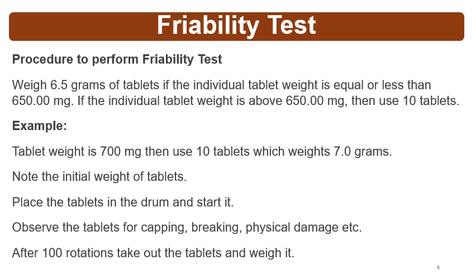The tablet weight is 700 mg, so use 10 tablets. Place the tablets in the drum and start. Note the initial weight of the tablets before placing them into the drum. Observe the tablets for capping, breaking and physical damage during the test.